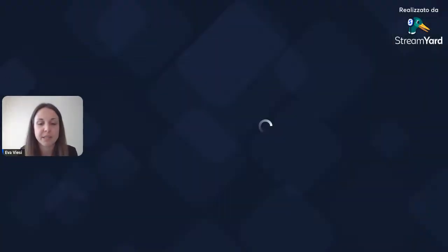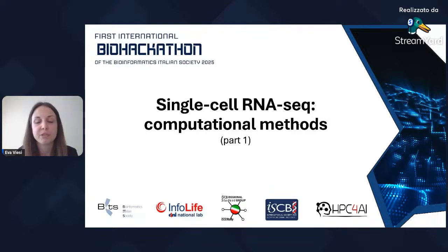Welcome everyone, I'm Eva Viesi, and today I will present some computational methods to preprocess single-cell RNA sequencing data. The first part of the webinar will be dedicated to data loading, filtering, normalization, and identification of highly variable features, while the second part, presented by my colleague Simone Avesani, will be related to data scaling, dimensionality reduction, batch effect correction, and integration.